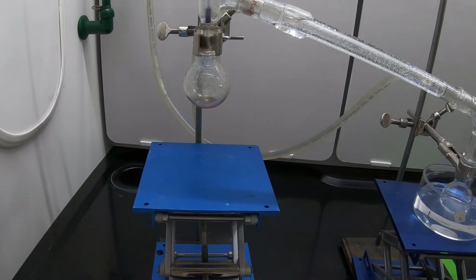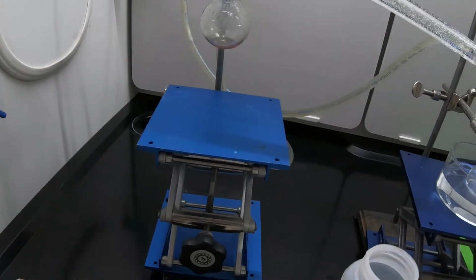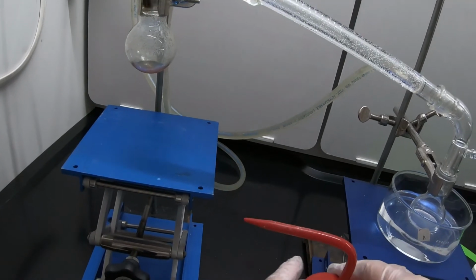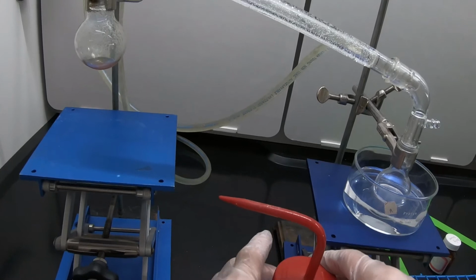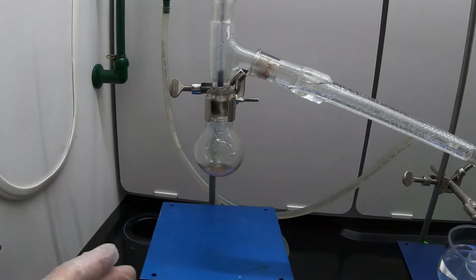I'm going to disassemble the glassware. Now, keep in mind, this stuff should be kept in the fume hood. It's going to be covered with the vapor of the product. And as such, anybody that's smelt alkenes before is very aware of how badly it smells. Those that have ever done fiberglassing, that's exactly what it smells like.